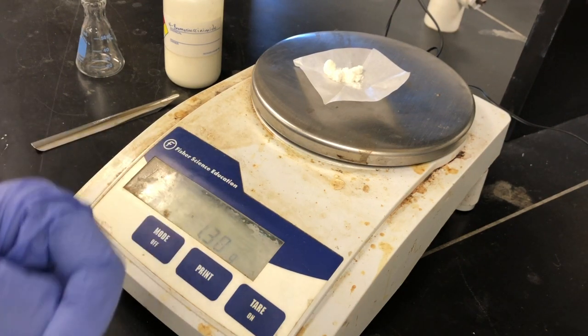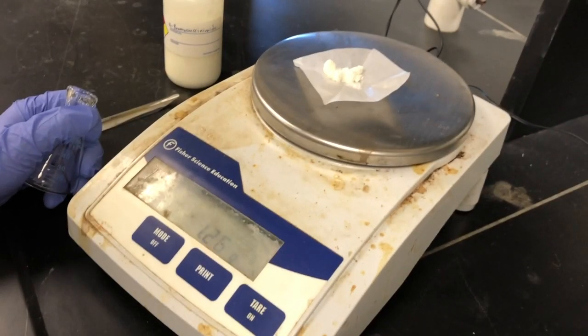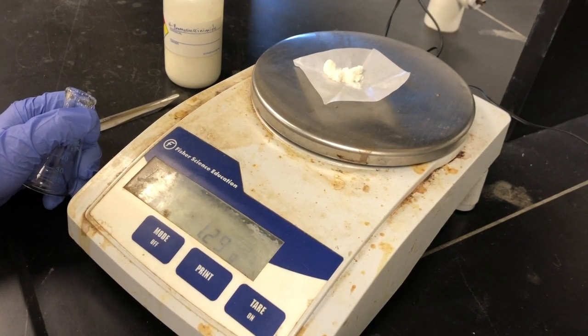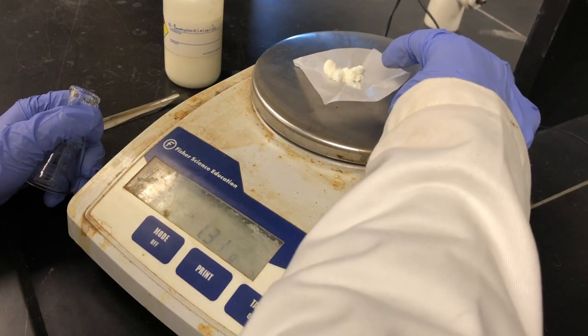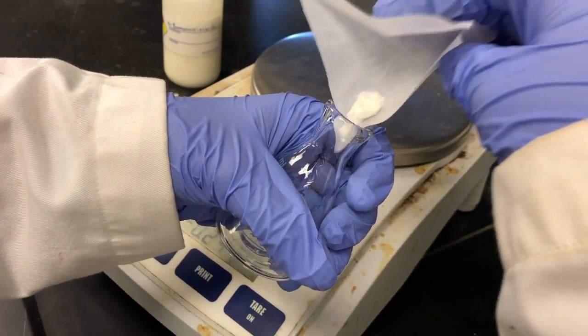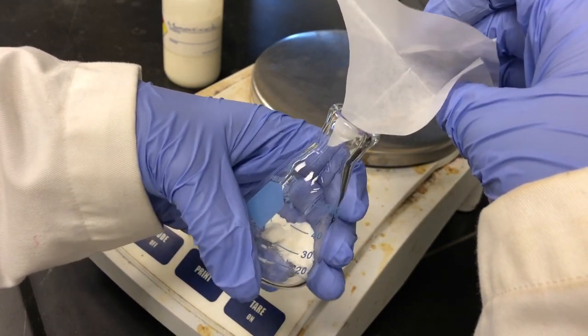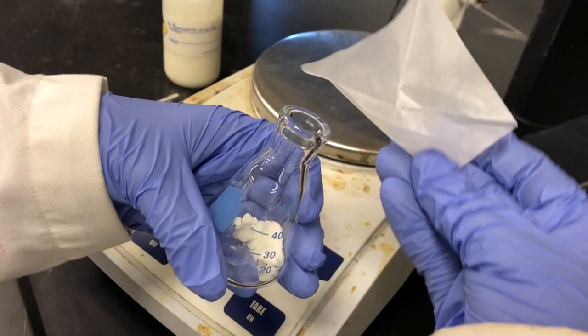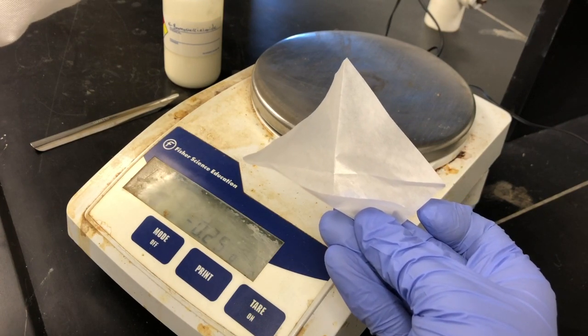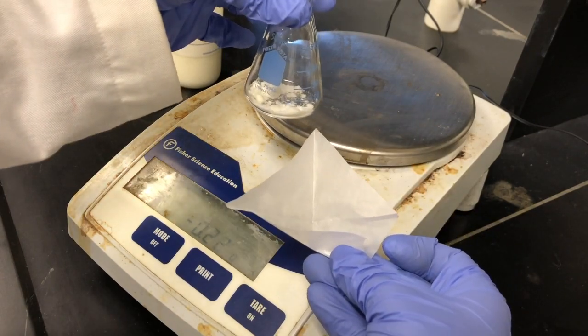Remember, your very last digit is your uncertainty digit. 1.30 is going to have to be it. I'm going to transfer that right into the flask. Make sure you don't drop any, because if you drop any, your initial mass is no longer accurate. Notice there's nothing left on the weighing paper, everything that we needed of NBS is right in the flask, and we didn't really make any sort of mess.